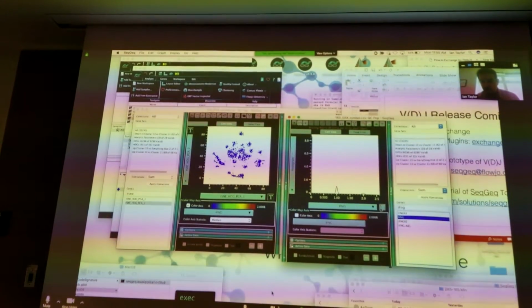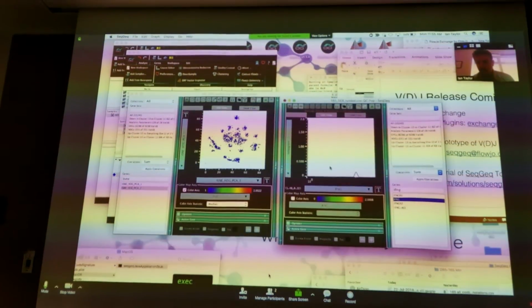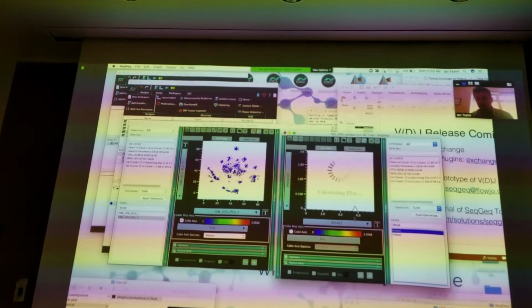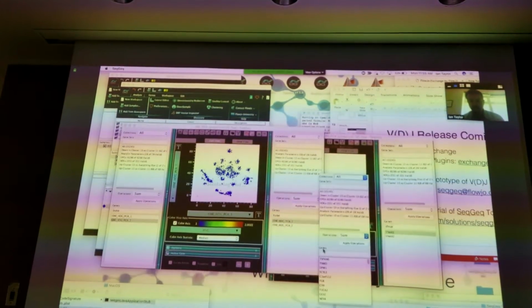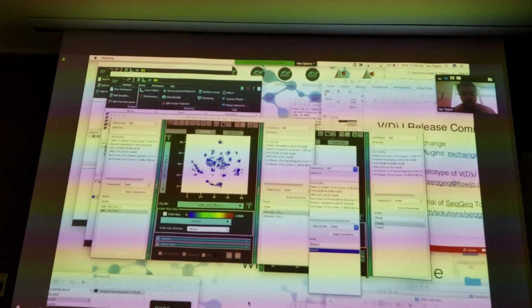Oh, that's interesting. Tell Wei Chen, what gene do you think? Just interferon IFNAR1. Yeah, interferon receptor 1, IFNAR1. Oh, there are some. There's a lot more activity.